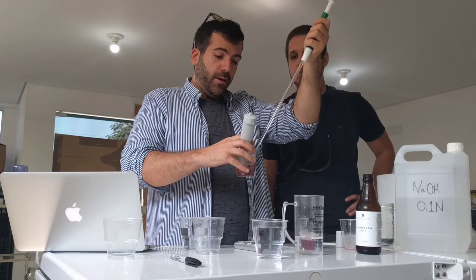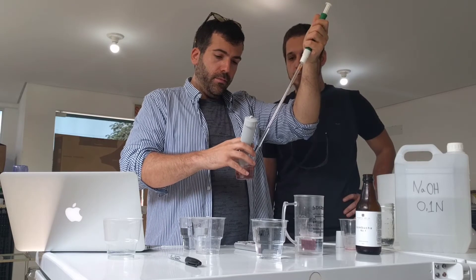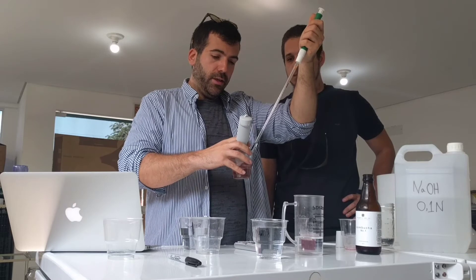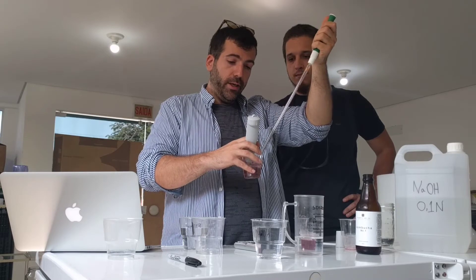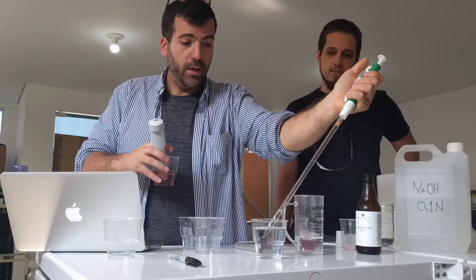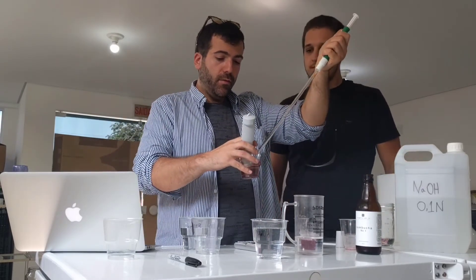So you can go slowly. We're at 4.8, 5.0, 5.1. This is where it starts to get really quick — one drop might change a lot at this point.